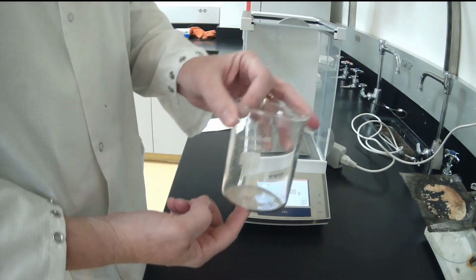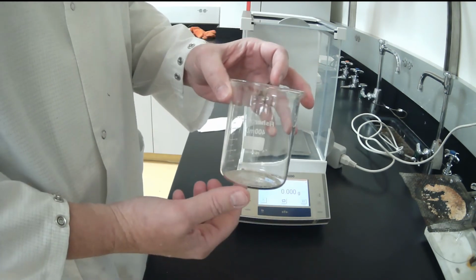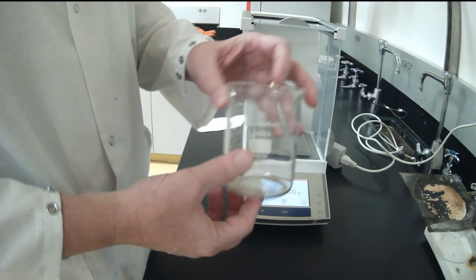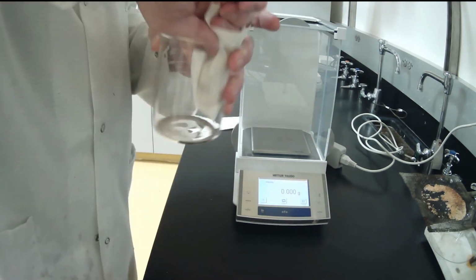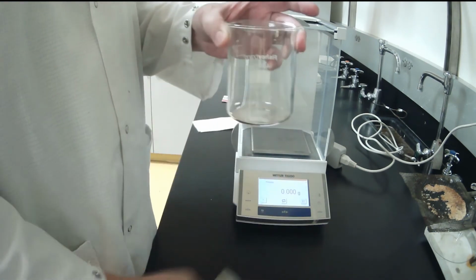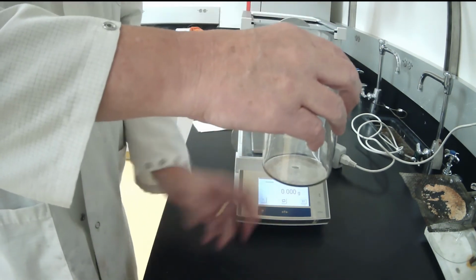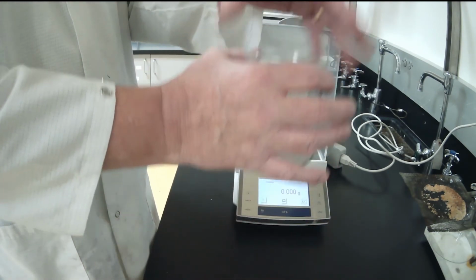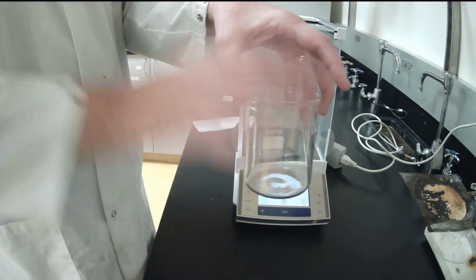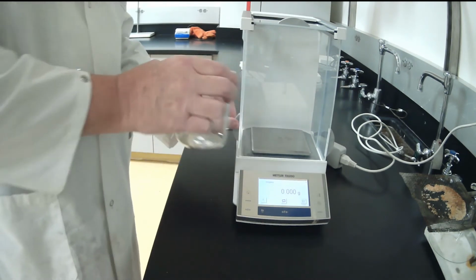One of the questions I ask my students: does a hot beaker weigh more or less than a cold beaker? I'll let you think about that for a second. Or does it weigh the same? You get three choices. And the truth of the matter is, if there was no air, it would weigh the same. But because there's air, hot air always rises up the sides, and if it doesn't escape fast enough, part of the beaker will actually be lifted right off the scale. So to avoid that, we have to make sure it's basically room temperature, and it is, before we weigh it.